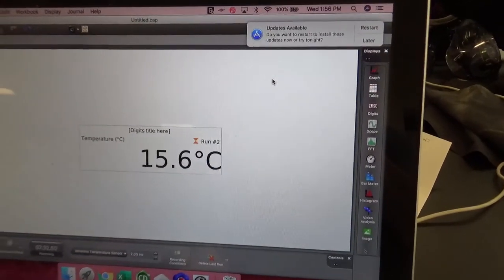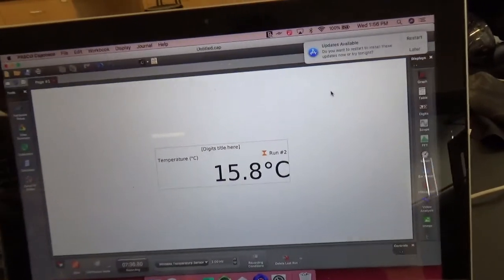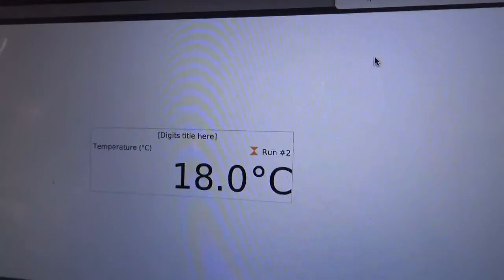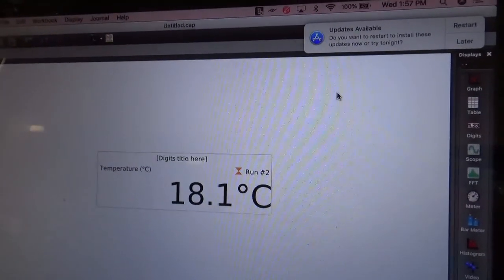You might be able to heat it a tad more. No, feel it. It's actually warm. It's actually too hot. Oh wow, it's very warm. And if it does get a little higher than 25, no problem, because I'm not at the saturation point yet.